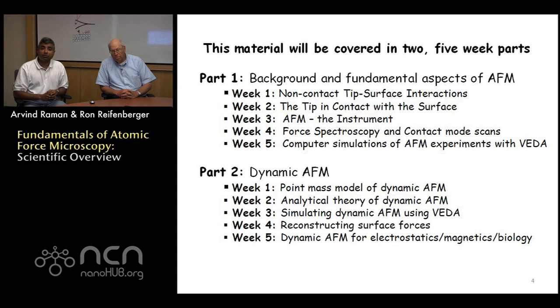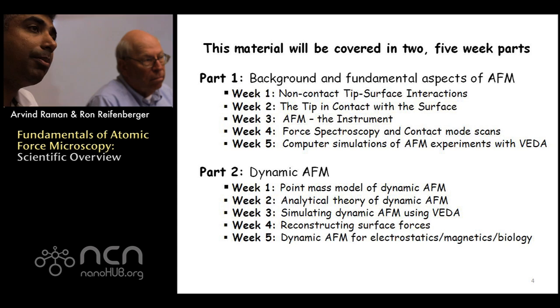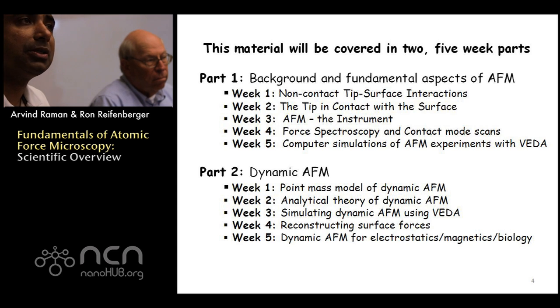We will go through a week on trying to understand how VEDA simulations can be used to understand how artifacts can come up in dynamic AFM methods, to understand what the link is between tip sample interaction properties and phase contrast or changes in the amplitude and so on.